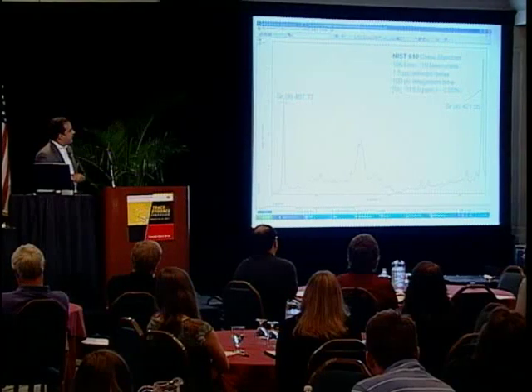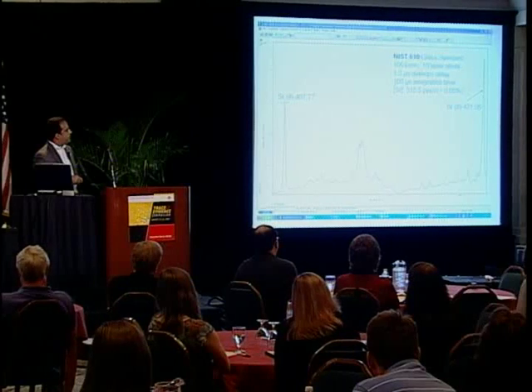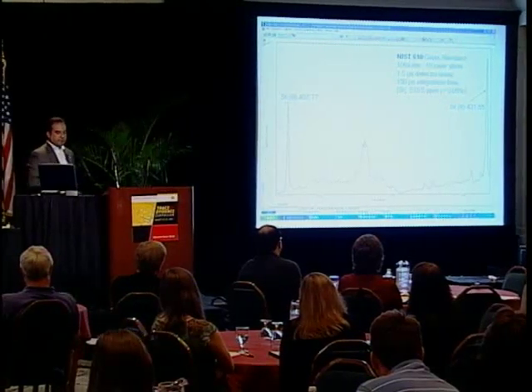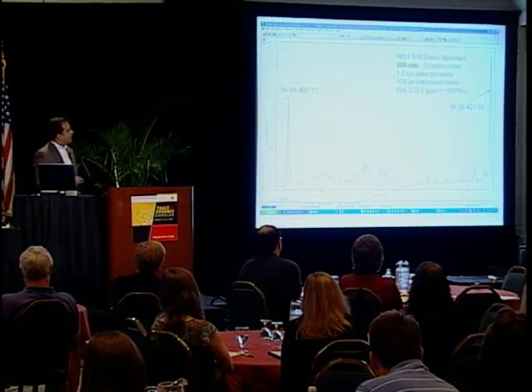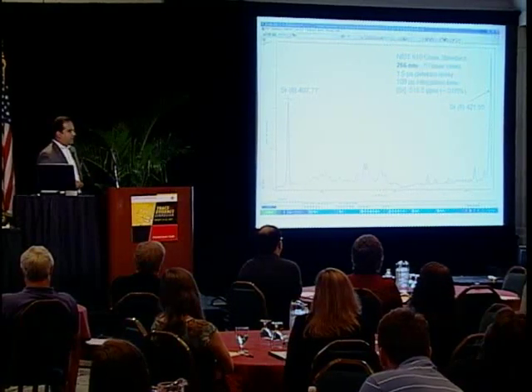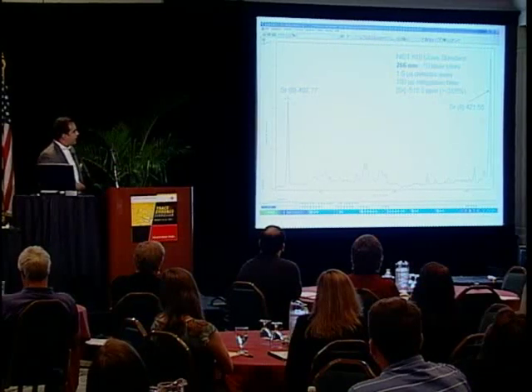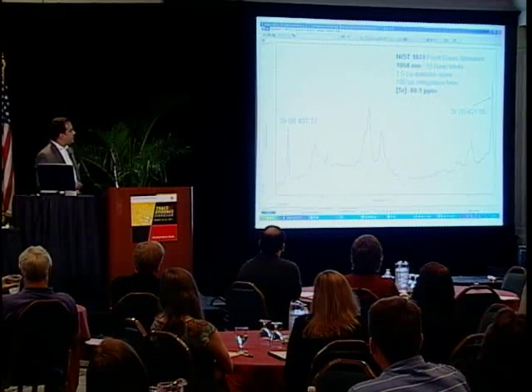If you focus in on the area of the strontium peaks, you can see that for a sample that has 500 parts per million, we have very good signal to noise for strontium peaks. We have been trying to use different wavelengths to see how that affects our ability to ablate material and then observe the plasma. So we're doing some of those experiments.